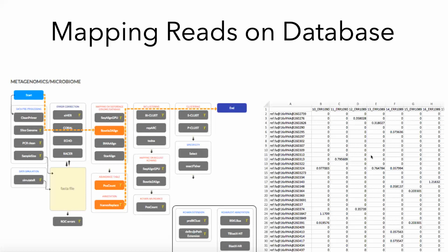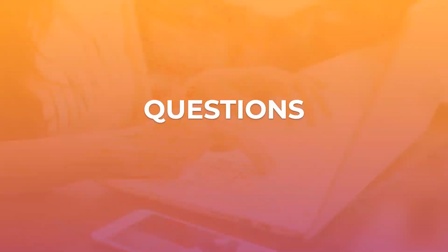So even the microbiome is important for treatment because the microbiome inside the gut has a role in how we are able to process different foods, process different chemicals, and effectively convert them into active elements that then are used for treatment. So a very important area of study. This is a very good place to start and understand what goes into the sequencing, annotation, and analysis of this kind of data. Okay, so any questions about metagenomics as we get started?